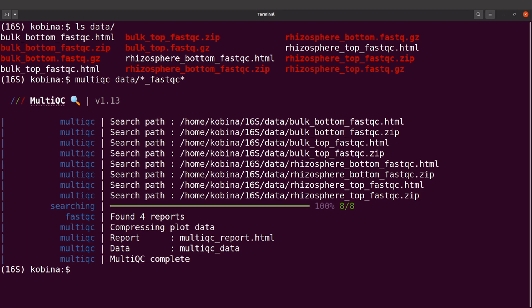We have that done. It says it has found four reports and aggregated all of them. We can find the output in the data directory.